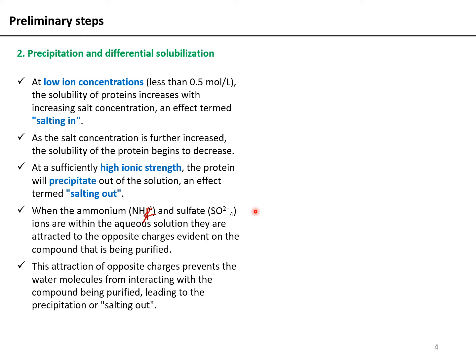So, let us backtrack for a moment. What ensures that your protein of interest is soluble in water? What do we exactly mean by its solubility? By stating that a protein is soluble in water, what we mean is that the protein molecule has a water shell, or a hydration shell, surrounding it. That is, there are water molecules all around the protein interacting with the charged residues exposed on the surface of the protein, ensuring that the protein is remaining within solution.